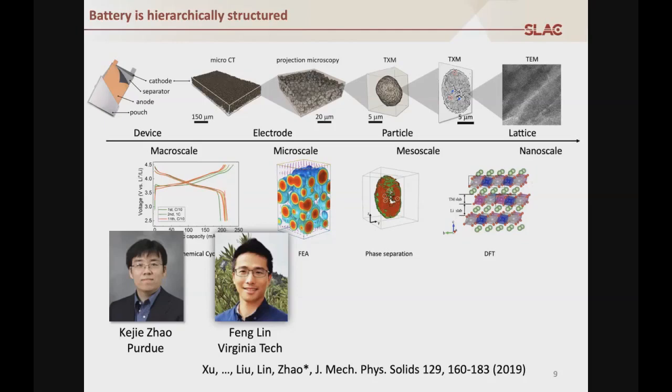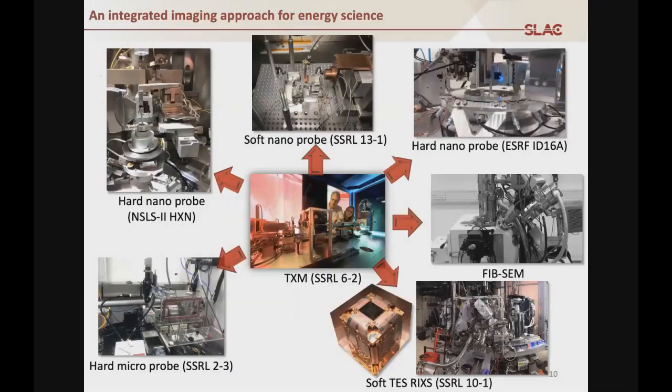And using X-rays, we can nicely tackle a broad range of length scales, which is very valuable for the studies in lithium-ion battery. So that's why we have been utilizing all these different instruments available at different beam lines, different facilities to tackle this scientific problem in a synergistic manner. I'm going to show you some specific examples.